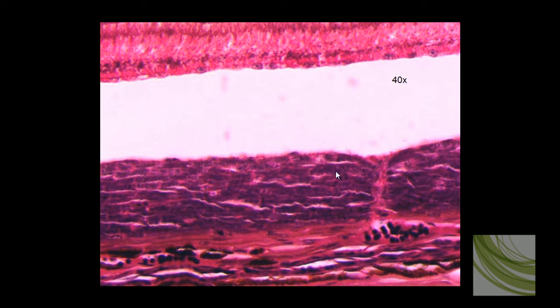Here is a closer view showing the choroid and the pigmented layer. There's the rods and cones, and in this slide they're actually separated.